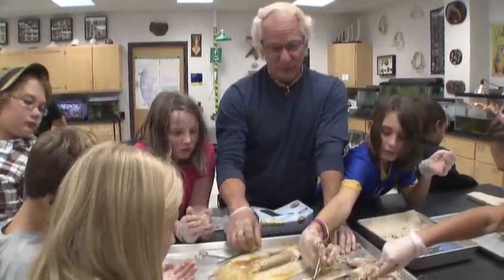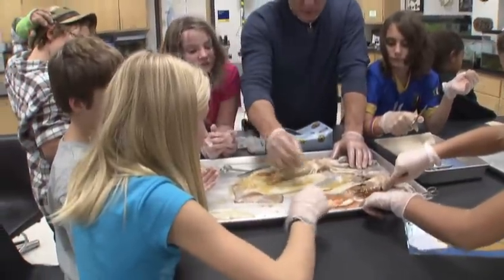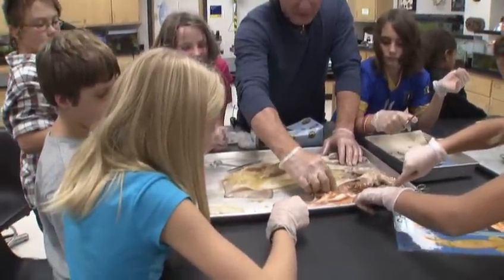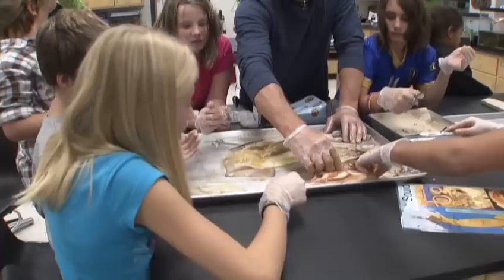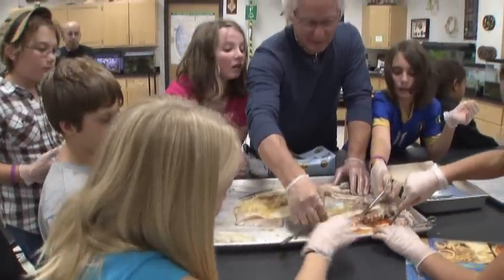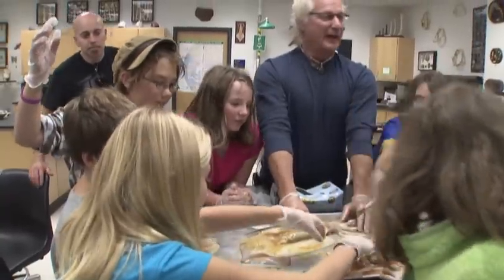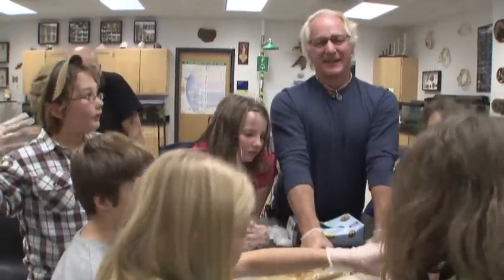Wait, stop. What is that? Good question. Is it a heart? It might have come from up here. It would have been right down here by the gills. Yeah, we found it. That's probably what that is. It's the systemic heart. Right here. Give me the snippers. Here, I'll snip it off.